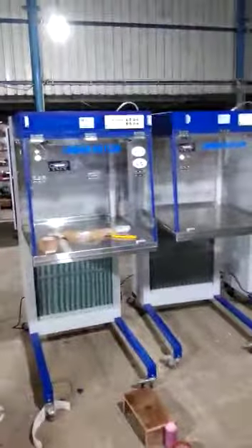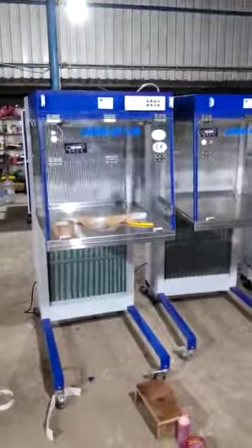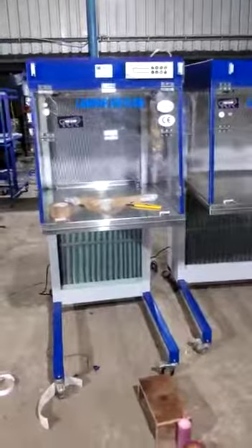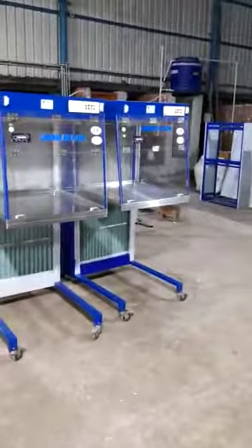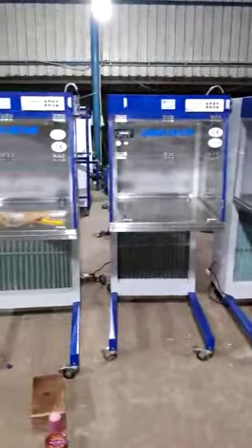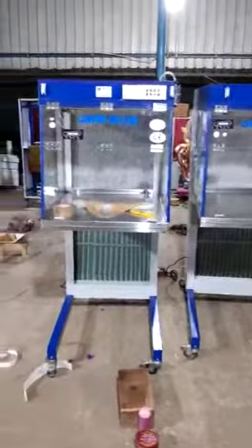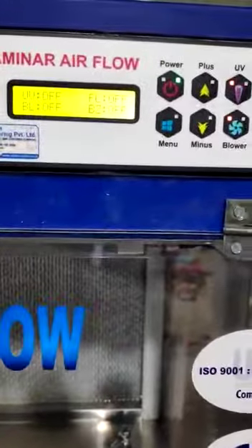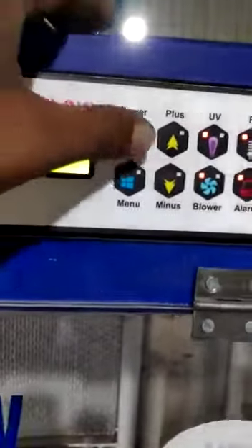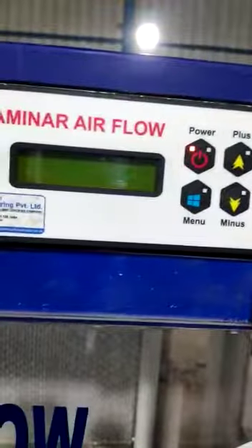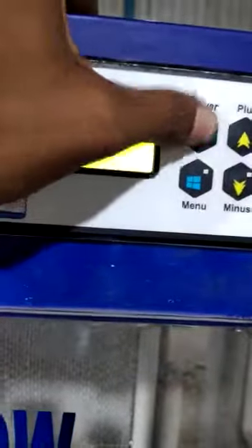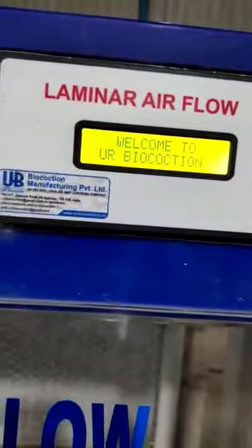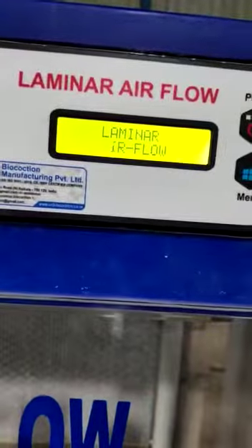Biocoction Manufacturing Private Limited laminar airflow. Welcome to your Biocoction — this is a horizontal laminar airflow. UV light is installed. This is power off, this is power on. Welcome to your Biocoction laminar airflow.